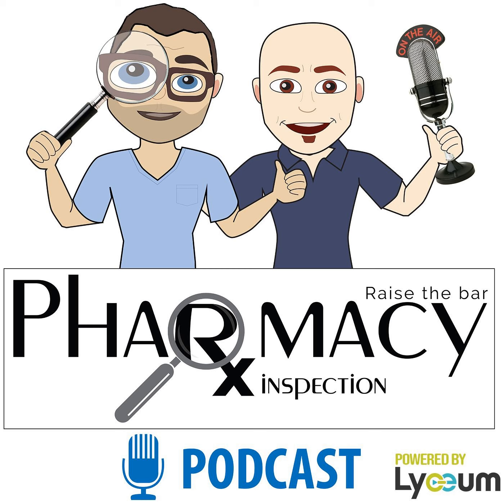Lastly, I'd like to encourage pharmacies to perform their own viable air sampling. These sampling devices range in price usually from $5,000 to $10,000, but can absolutely give you more data to defend your operation from batches being called into question for sterility concerns. The point here is that the pharmacy should have made the purchase of a viable air sampler, made improvements, then performed viable air sampling while compounding operations took place. Had this been done, you could have seen a real trend line, and further analysis could have been done while certain fixes, like more cleaning, training operators, retraining operators, different garbing, engineering control examination were taking place one at a time.